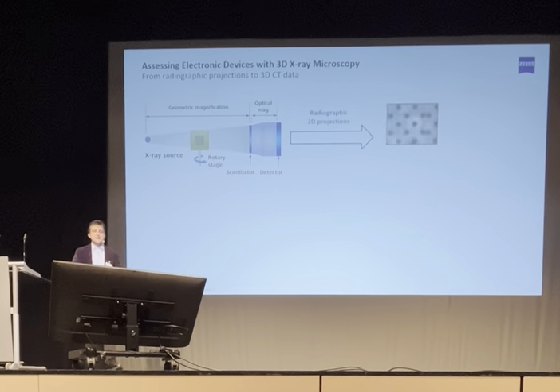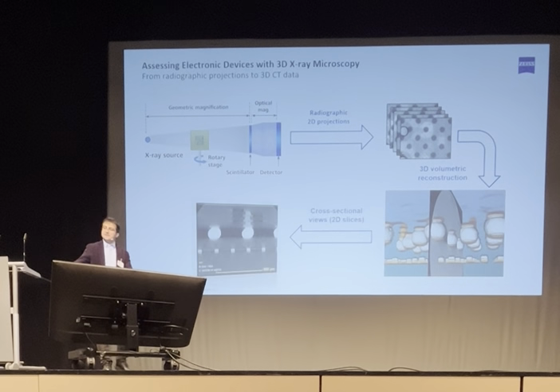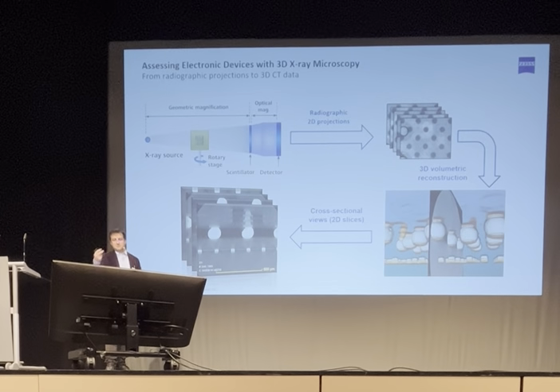Here is a summary of the typical workflow from radiographic projections to 3D CT data, and you already know this process pretty well. The only difference here is that we are inserting the optical magnification.